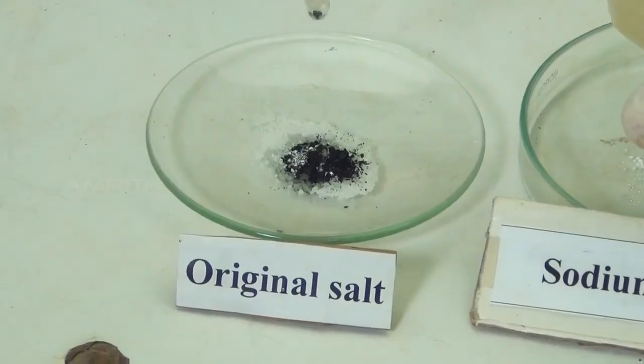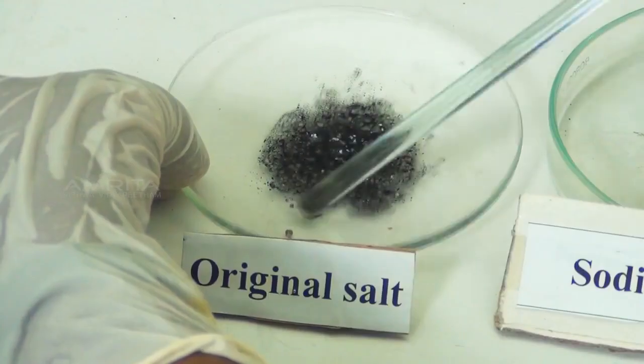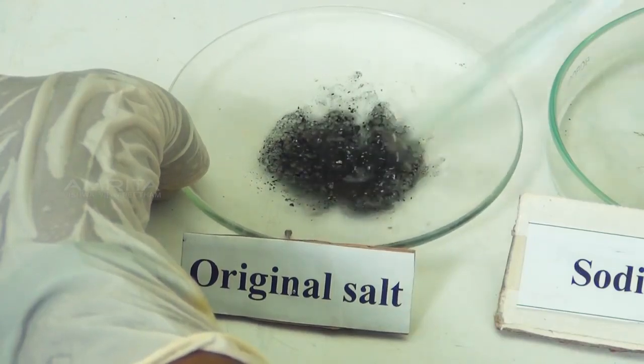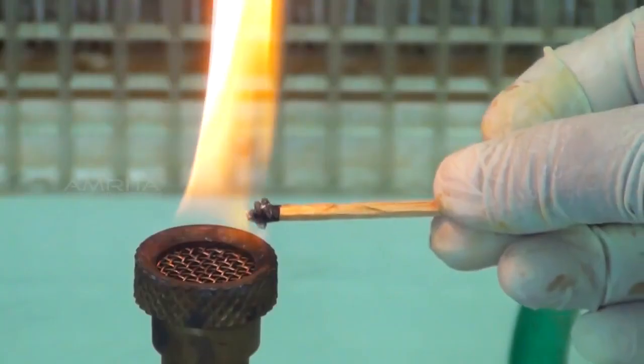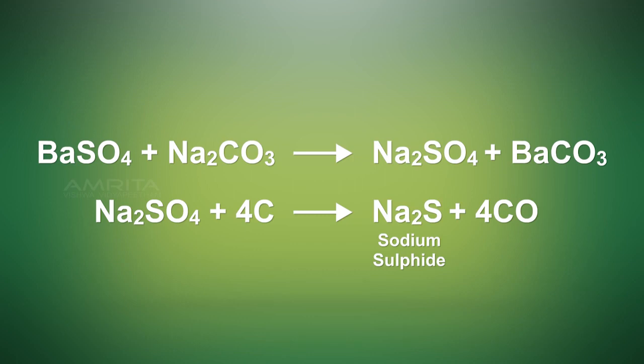Now, add a few drops of distilled water to the mixture. Mix the contents of the watch glass with a glass rod so as to get a paste. Take some of this paste on one end of a wooden splinter and heat in the reducing flame of the Bunsen burner. Sulphate reacts with sodium carbonate and charcoal to form a fused mass of sodium sulphide.